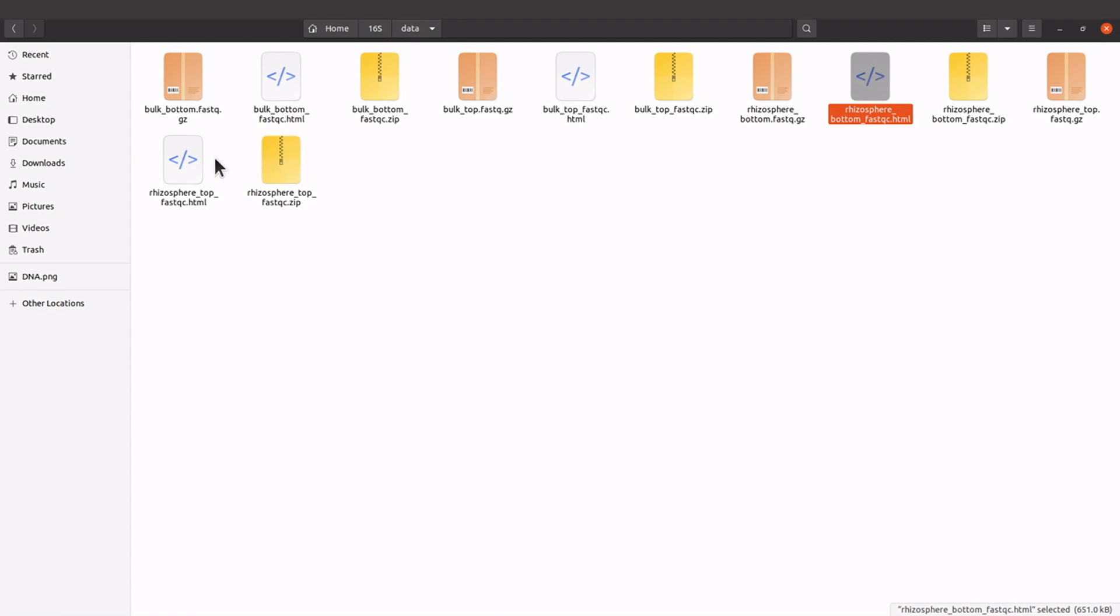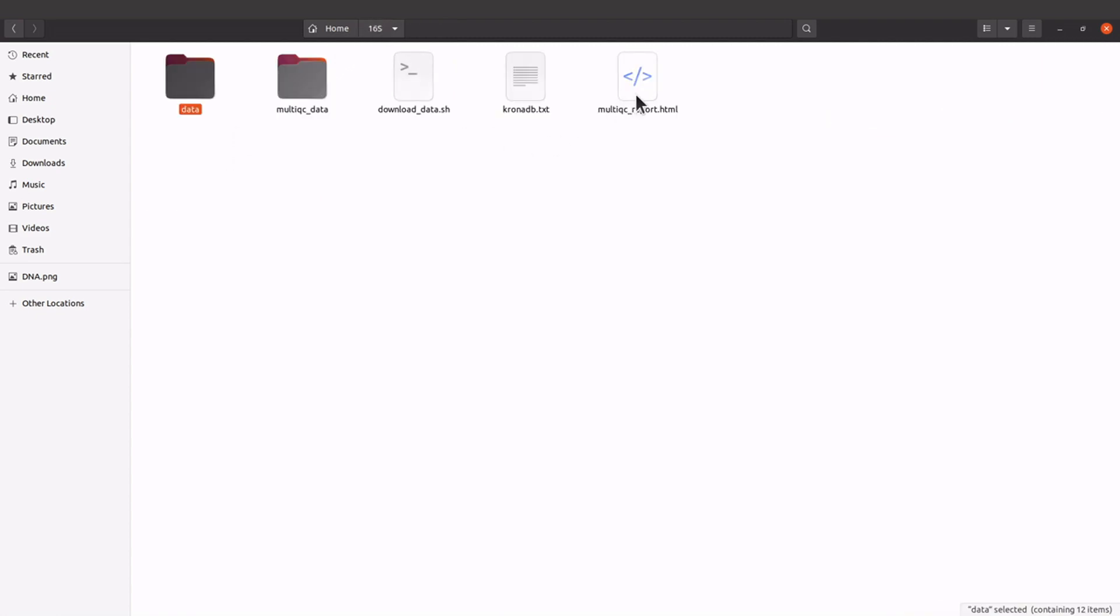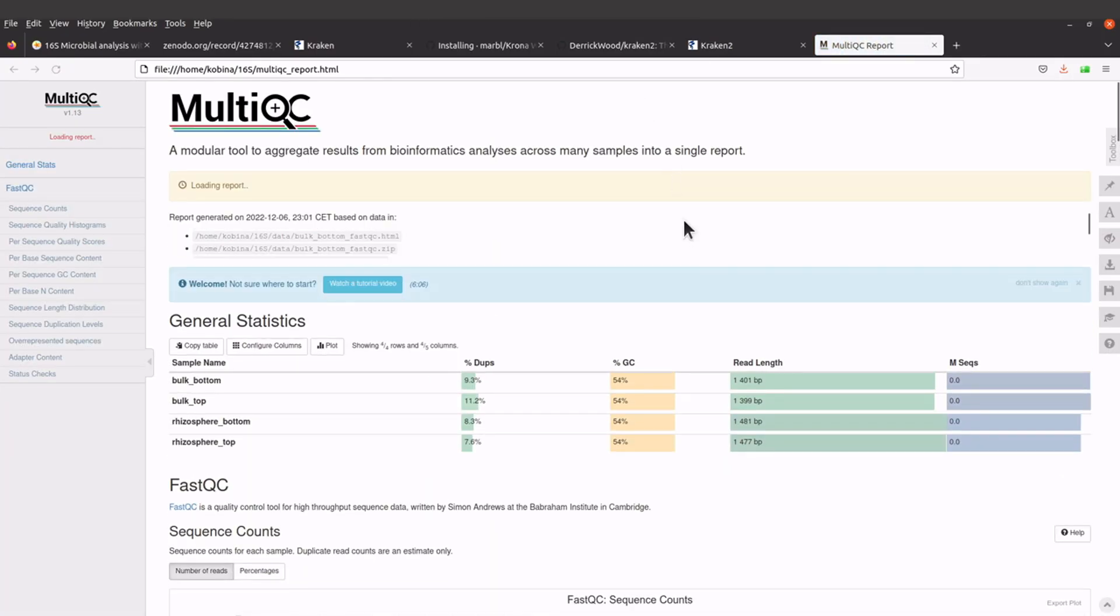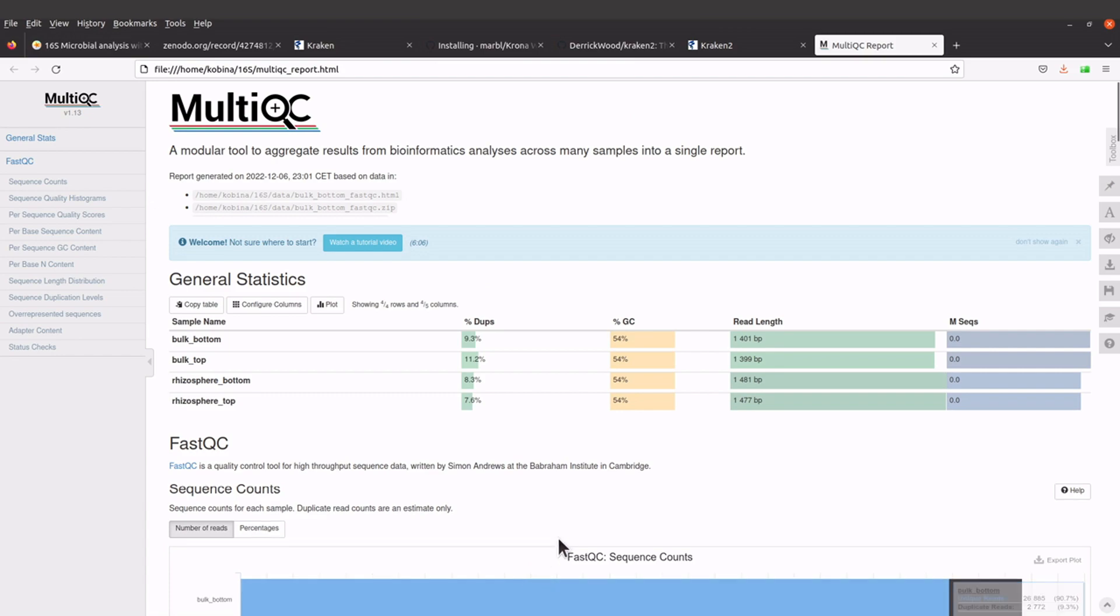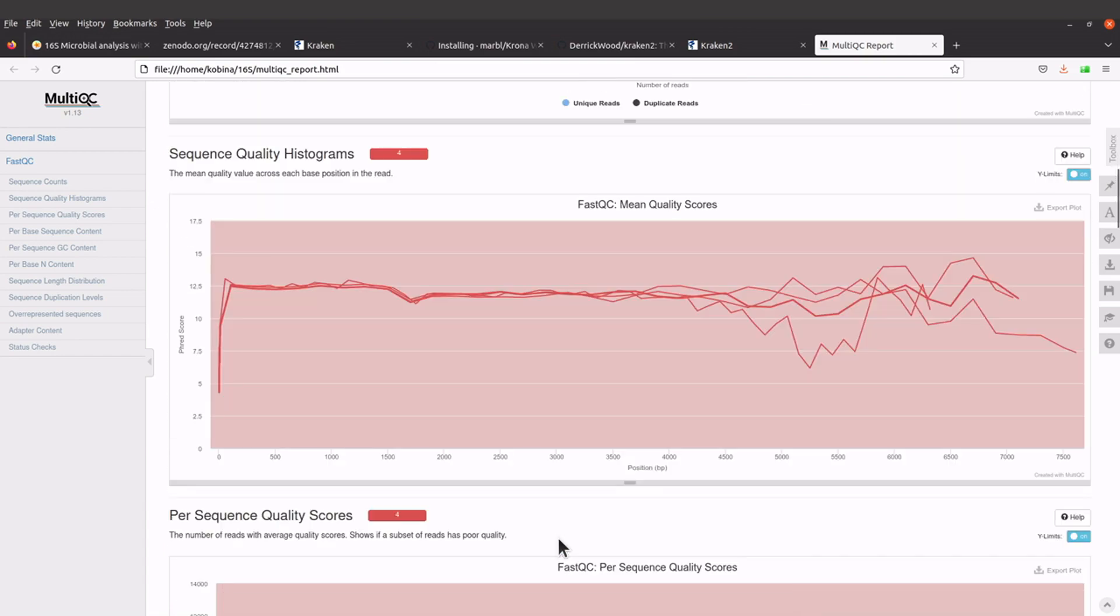There are four of them. We are going to use the multiqc report because it has all the reports. Let's open this in the browser. Okay, the report has been opened so you can scroll through and check.